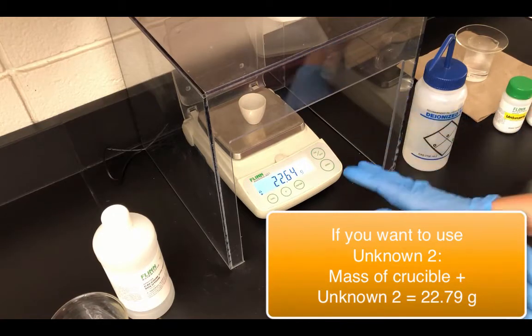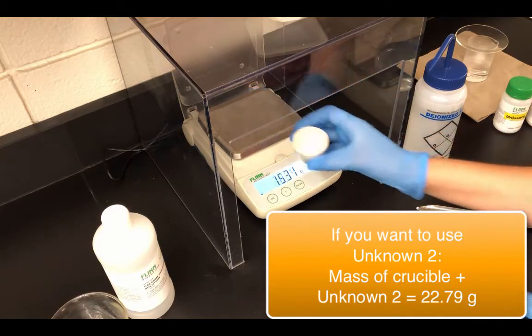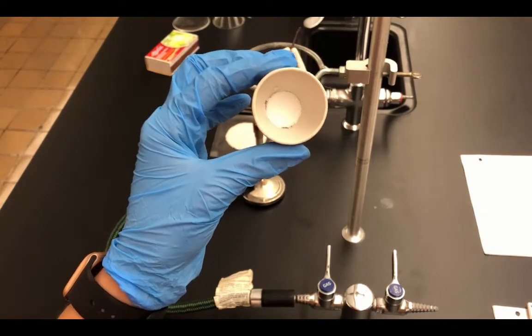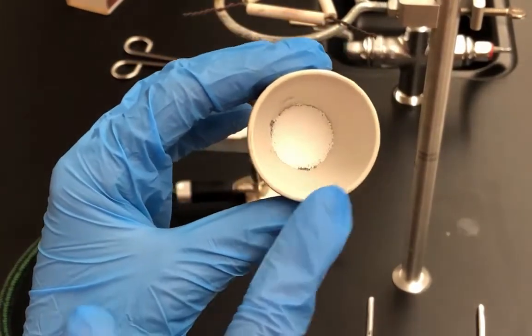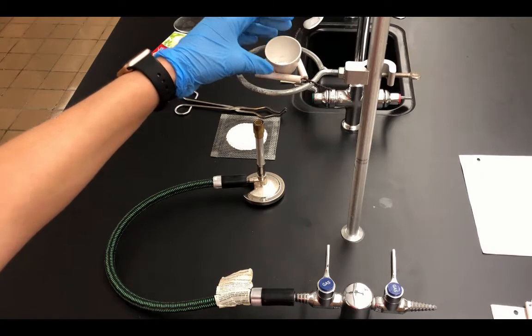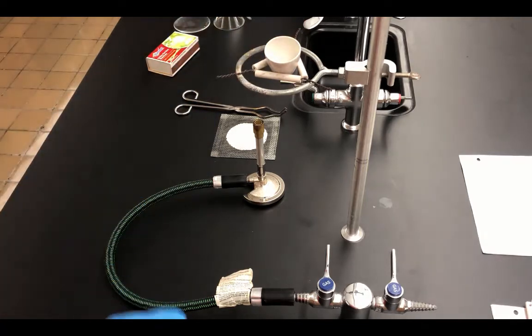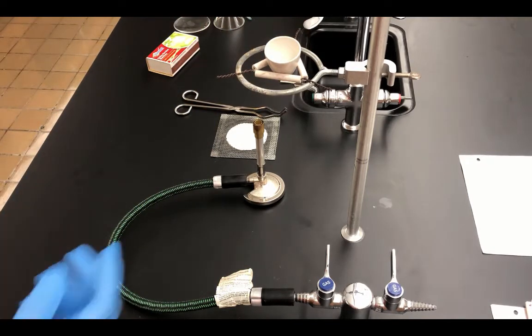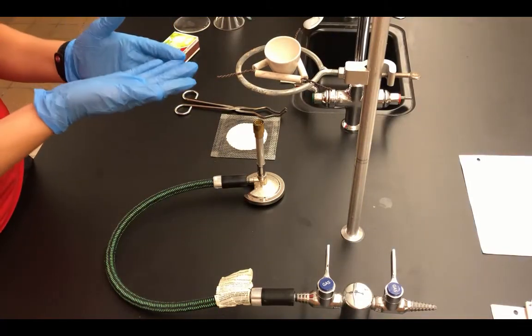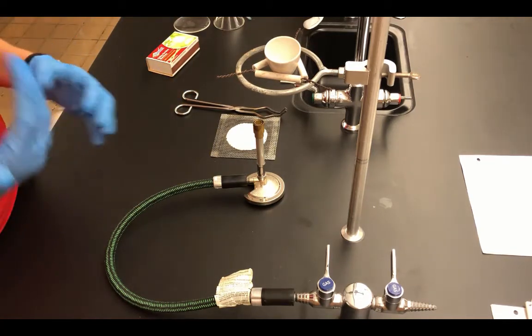So now that we have the crucible with the unknown, we're going to take it back and start heating the crucible. Now that we have the metal carbonate in the crucible, make sure you make an observation of what it looks like. We're going to put it in the clay triangle and heat it. When you heat a substance in a crucible, you want to tilt it just a little bit, just like the figure in the lab, to allow the water to escape. The whole point of heating this crucible is that we want to remove any water from the substance. We want to create an anhydrous substance.